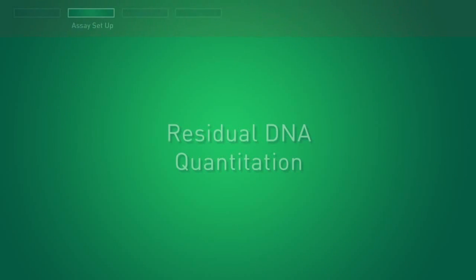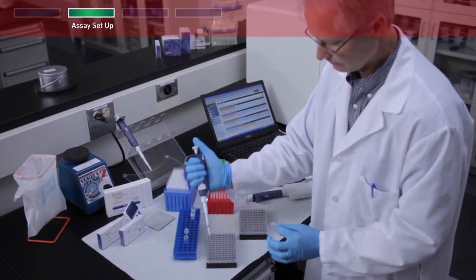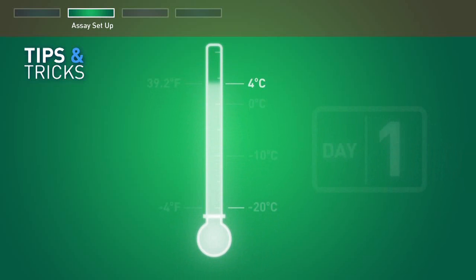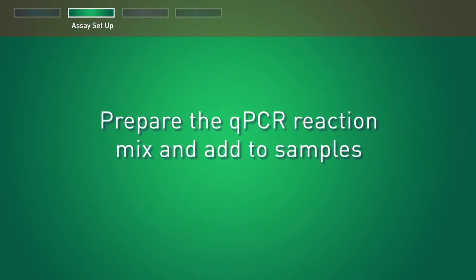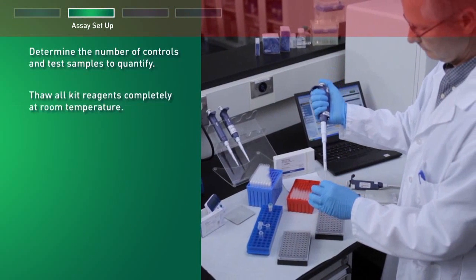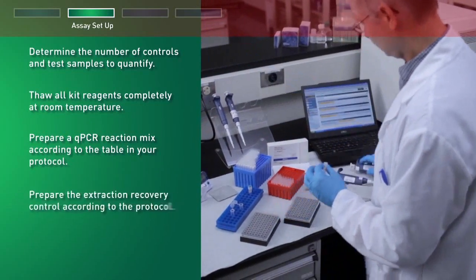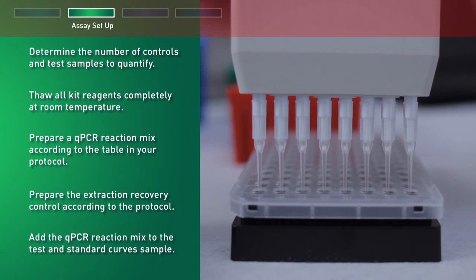The next step in this protocol is residual DNA quantitation. To run the resDNA SEQ residual DNA kit, begin by preparing serial dilutions and a standard curve. Store the DNA dilution tubes at 4 degrees for use on the day of preparation; otherwise store at minus 20 degrees and use within one week. First, determine the number of controls and test samples to quantify, then thaw all kit reagents completely at room temperature. Prepare a qPCR reaction mix according to the table in your protocol, and prepare the extraction recovery control according to the protocol, then add the qPCR reaction mix to the test and standard curve samples.